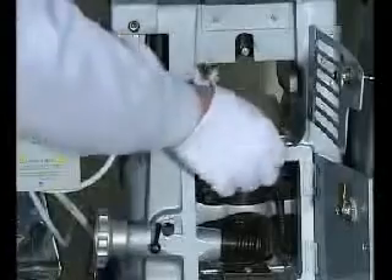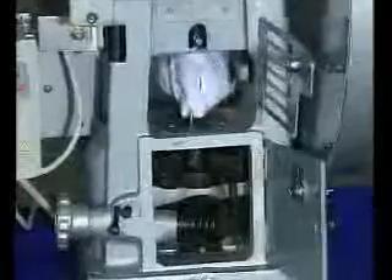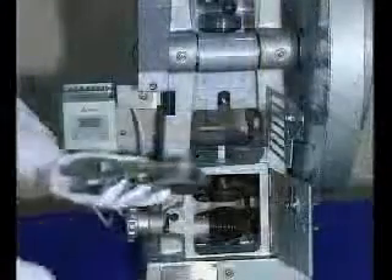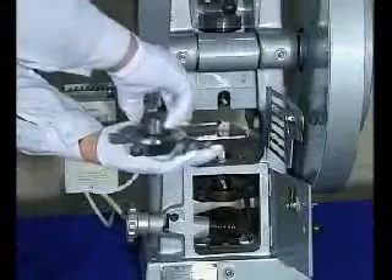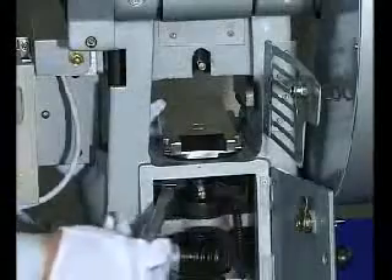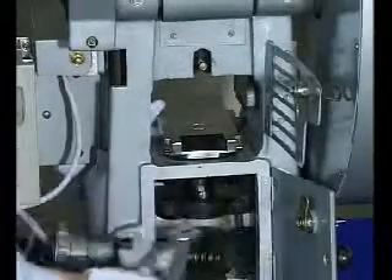Remove the fixing screws of the upper and lower punch on the die plate, and take the die plate off. Insert the lower punch into the end of the hill, making the inclined plane of the lower punch aim at the fixing screw. Tighten the screw until the lower punch can rotate but cannot move up and down. Install the die into the die plate, hold it by hand, and insert the lower punch into the die board. Place it on the die table lightly, then tighten the three screws until the die plate can move horizontally but not up and down.